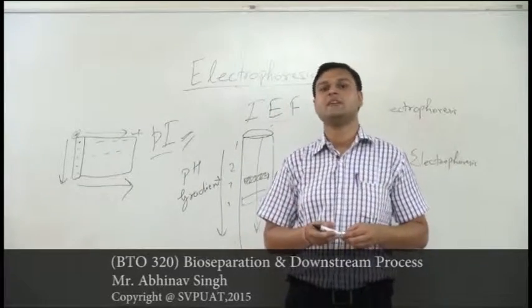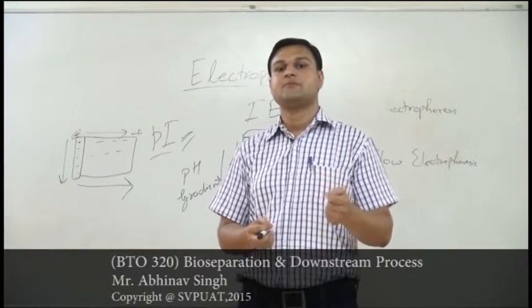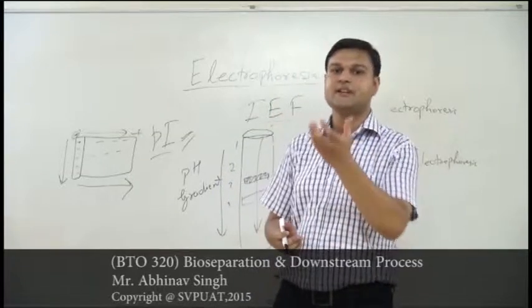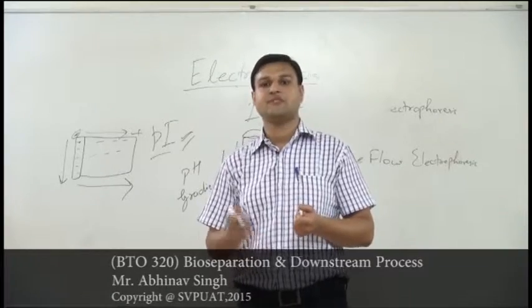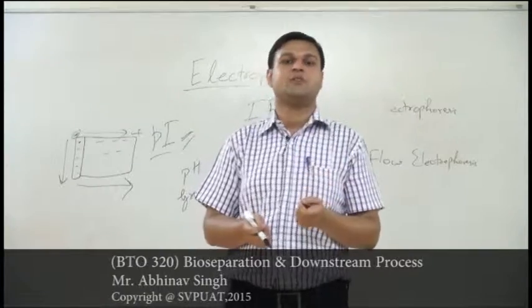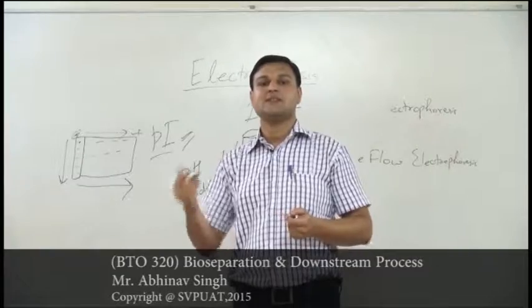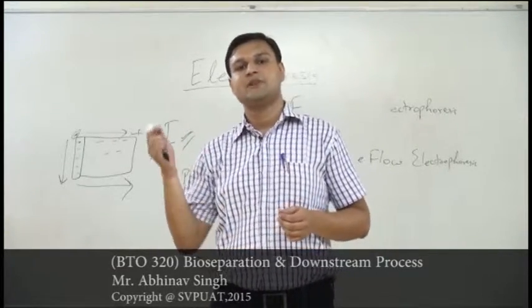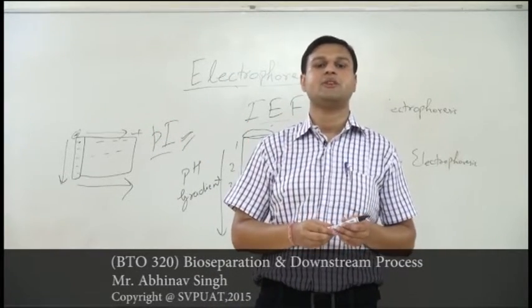The same is the principle for protein separation. For proteins we do not use horizontal gels; we use vertical gels, because a vertical gel provides one more efficiency: the sinking of the protein due to the motion of the electrophoresis. As we have seen, for protein purification the gels that are cast are of capillary size and very small. Thus the vertical system is much more beneficial, both for loading and for the movement of the protein into the system.